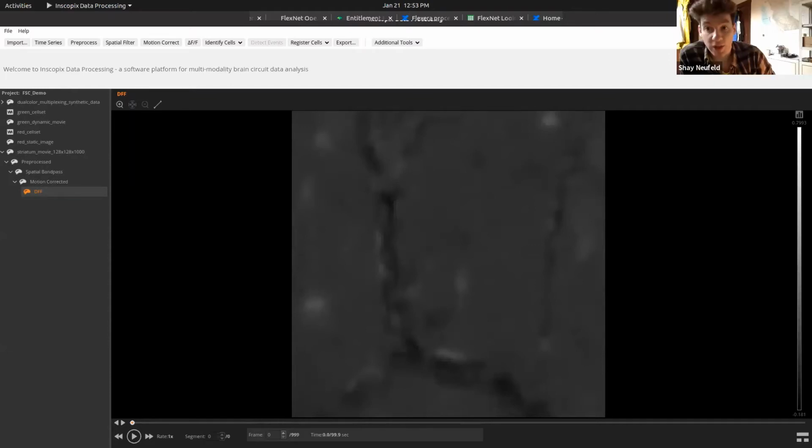So would that be a satisfying feature for users if they were just able to say this line represents this many microns, and then that would put a scale bar on the movie? Yeah, because that's happening in ImageJ right now, and so that's what I was thinking of. And those are the requests I've heard about.